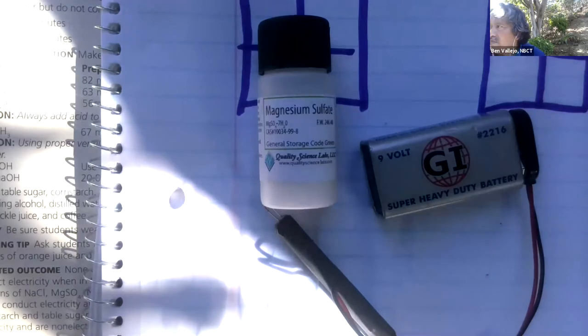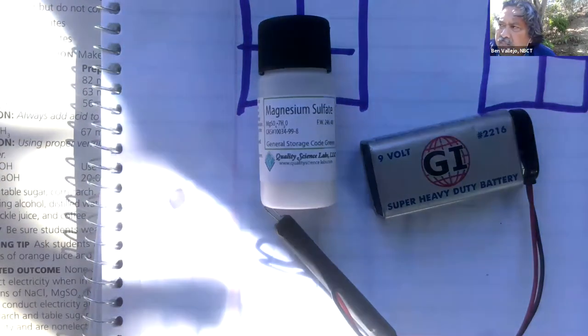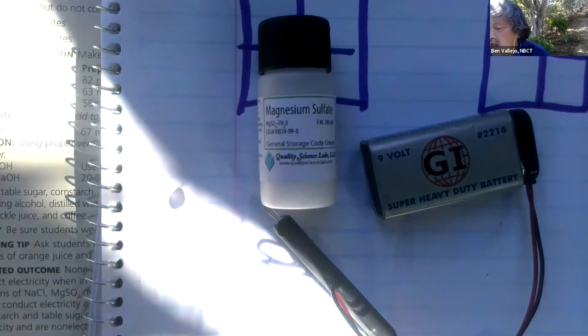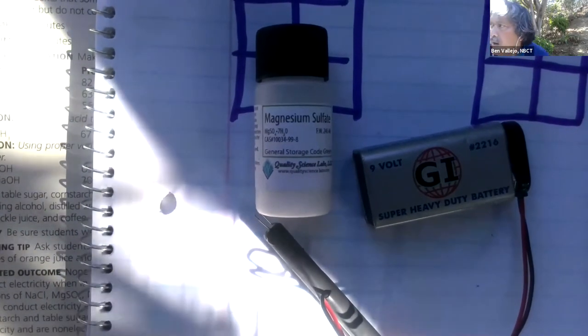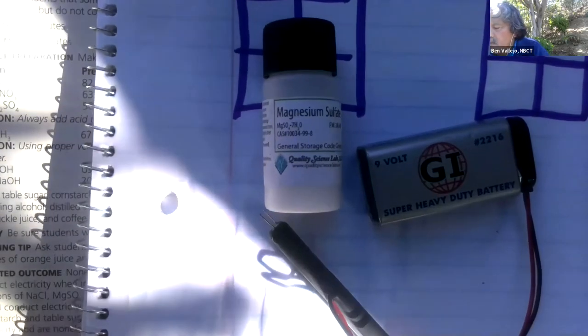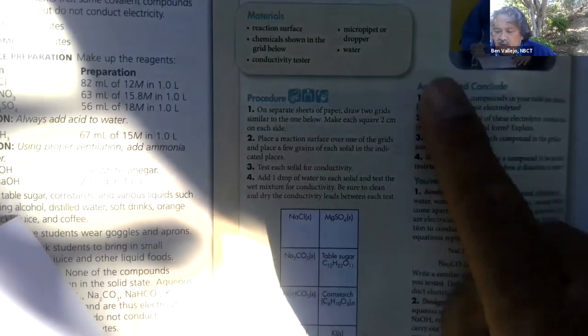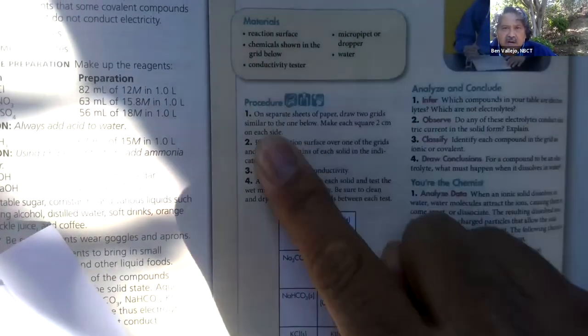And then remember after that, you have four parts of the lab report. Those four parts are the introduction, and you could write a few sentences about what's happening here. After that, there's the materials and methods. I would go ahead and take a picture of 508 and call that materials and methods, because that's what that section is right here.